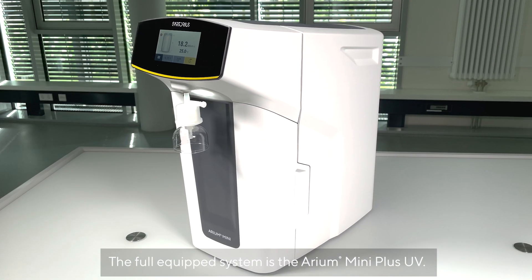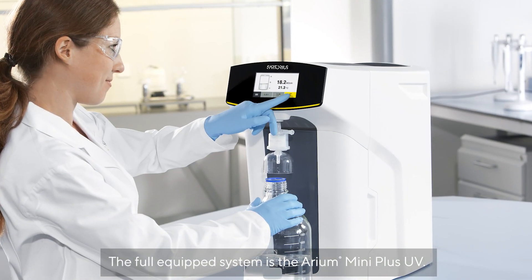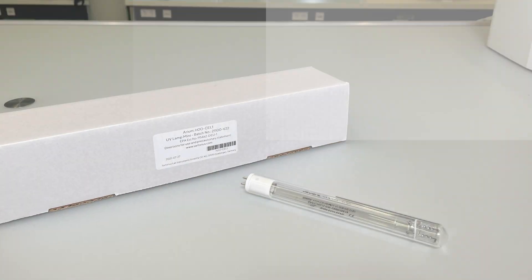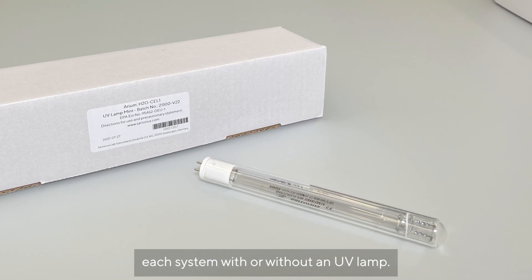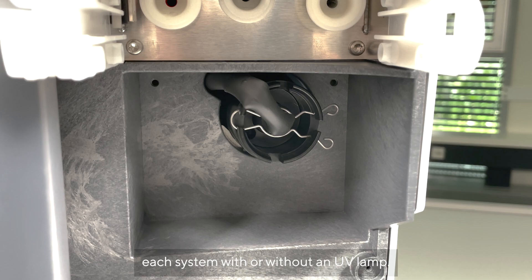The fully equipped system is the Arium Mini Plus UV. Additionally, based on your application, you can choose each system with or without a UV lamp.